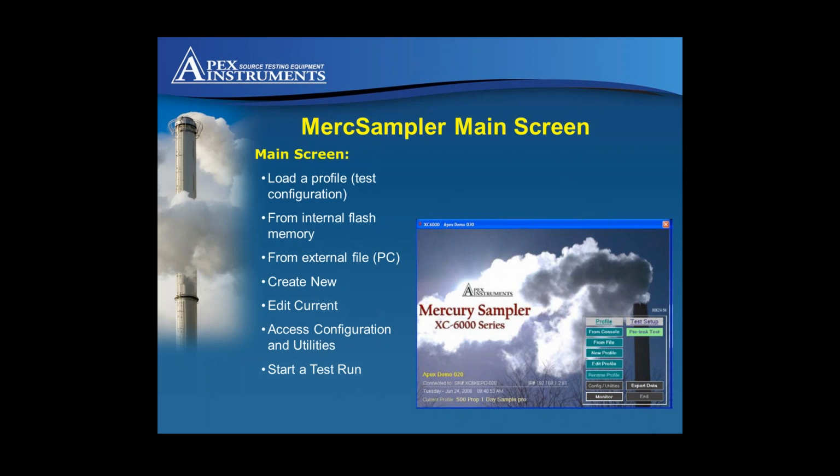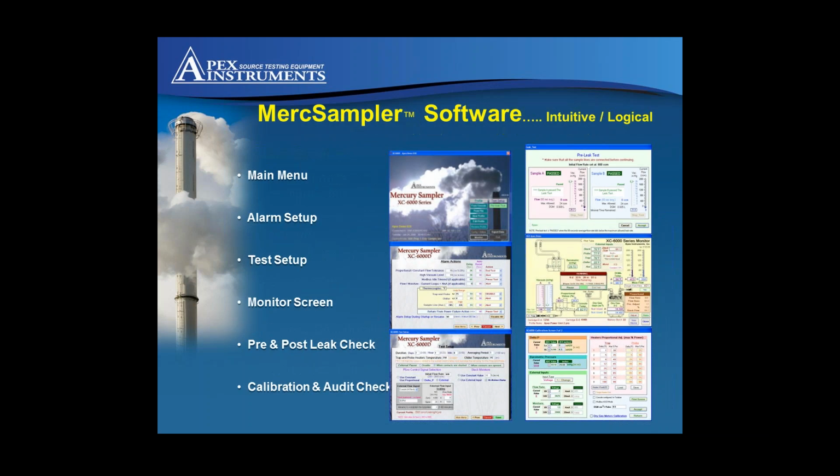So once you set up a profile, here's the typical layout. So connection is the first screen up at the top. The next one would be the alarm screen where you would choose alarms. And actually that's not the right order. Process, yeah.